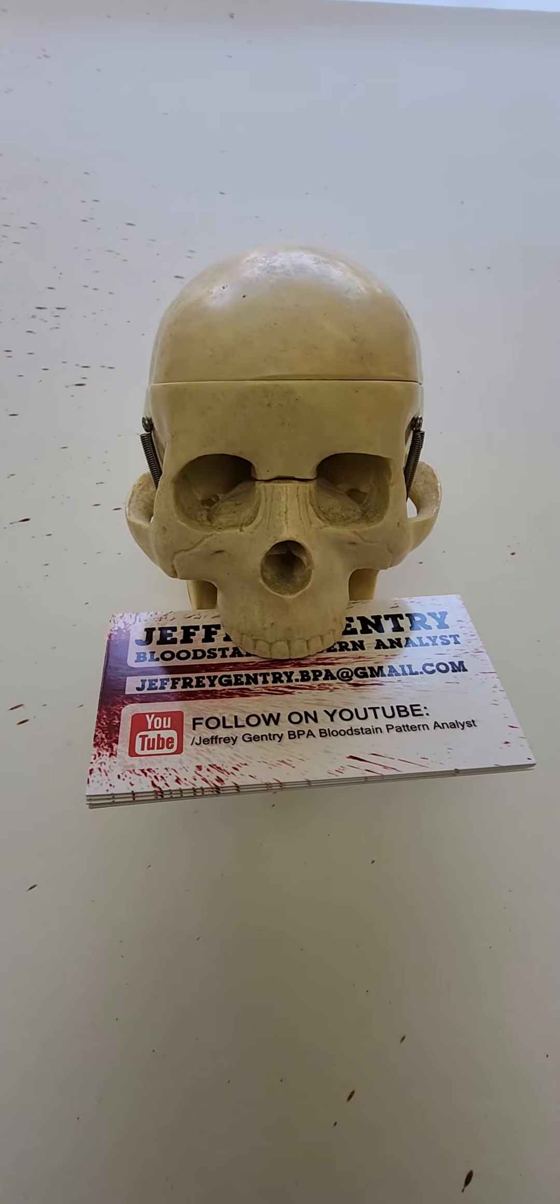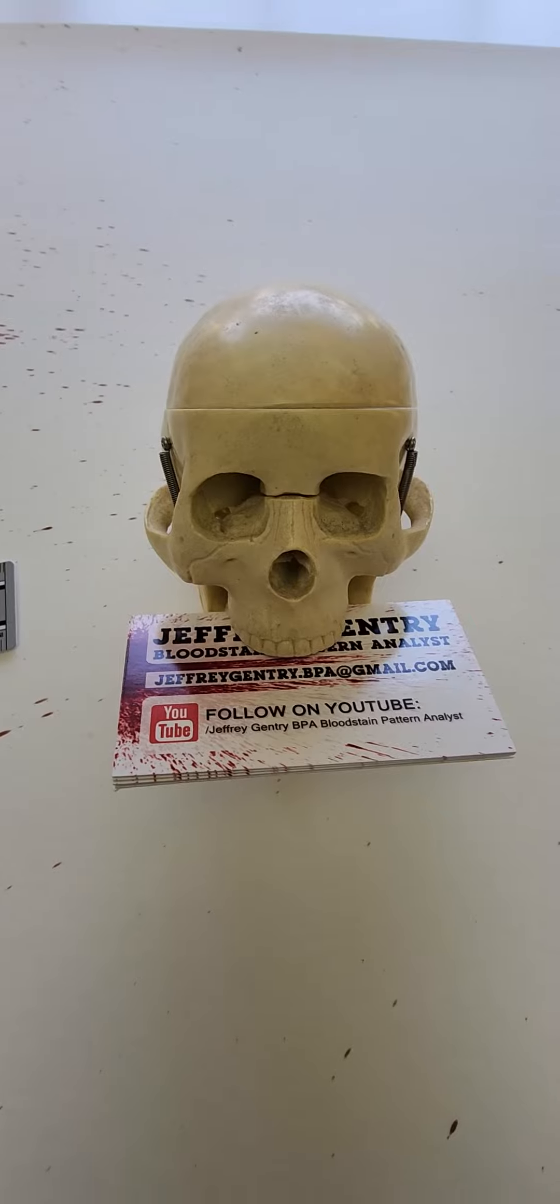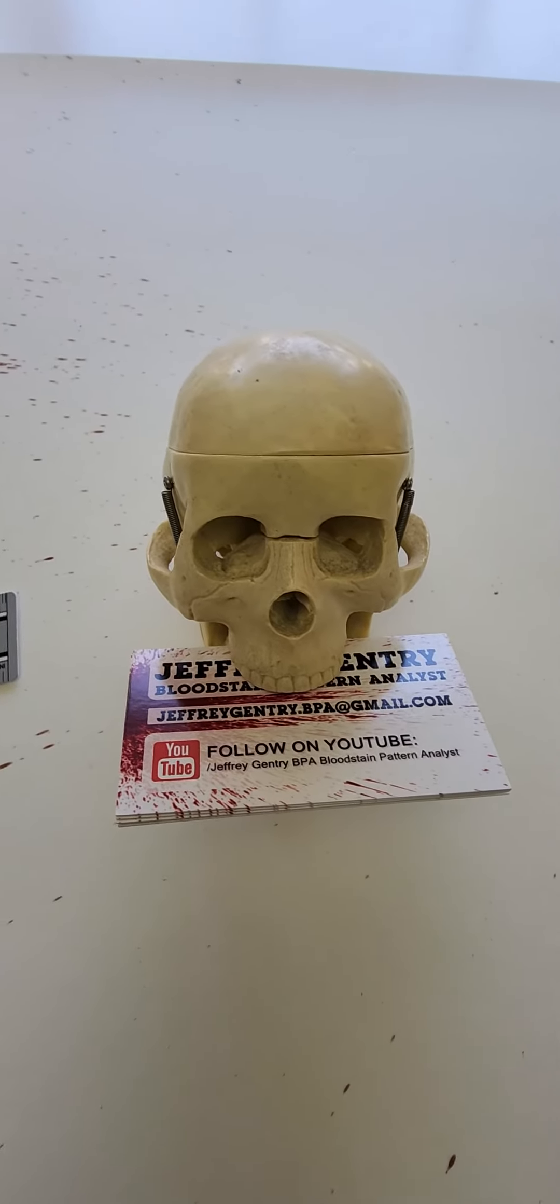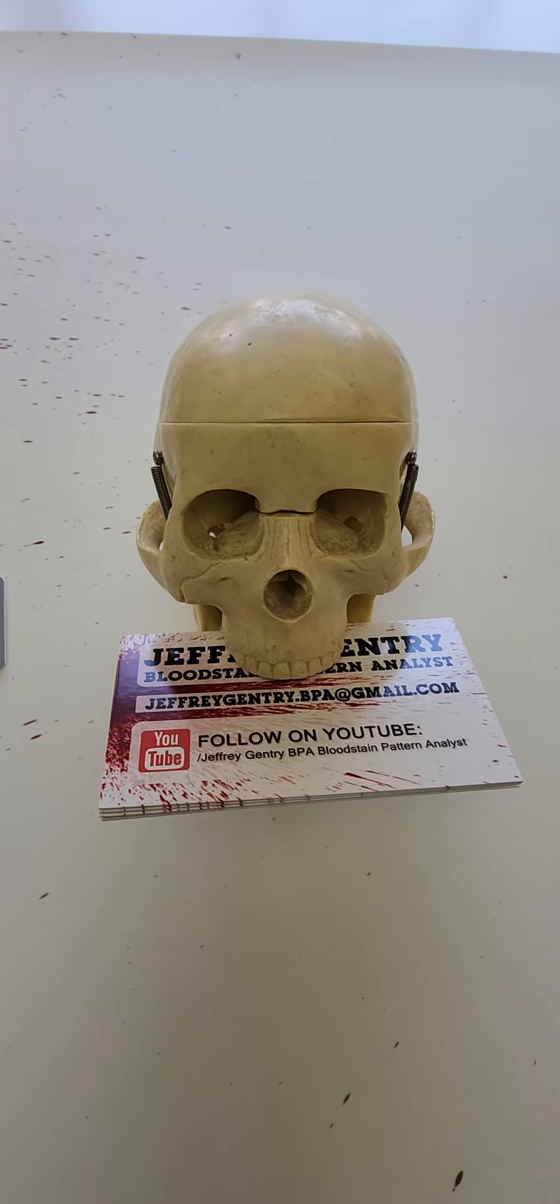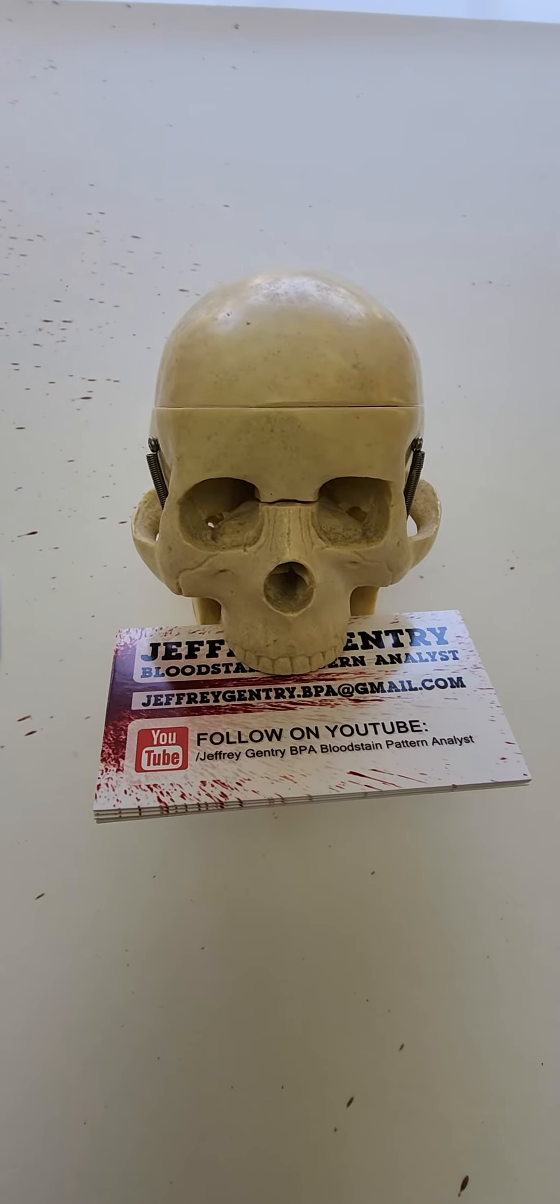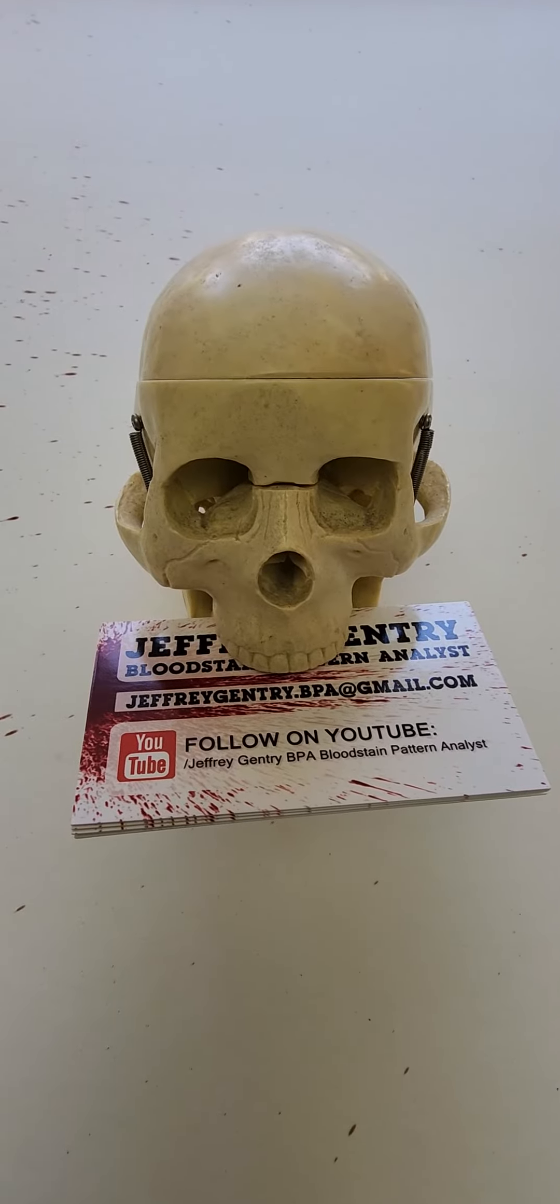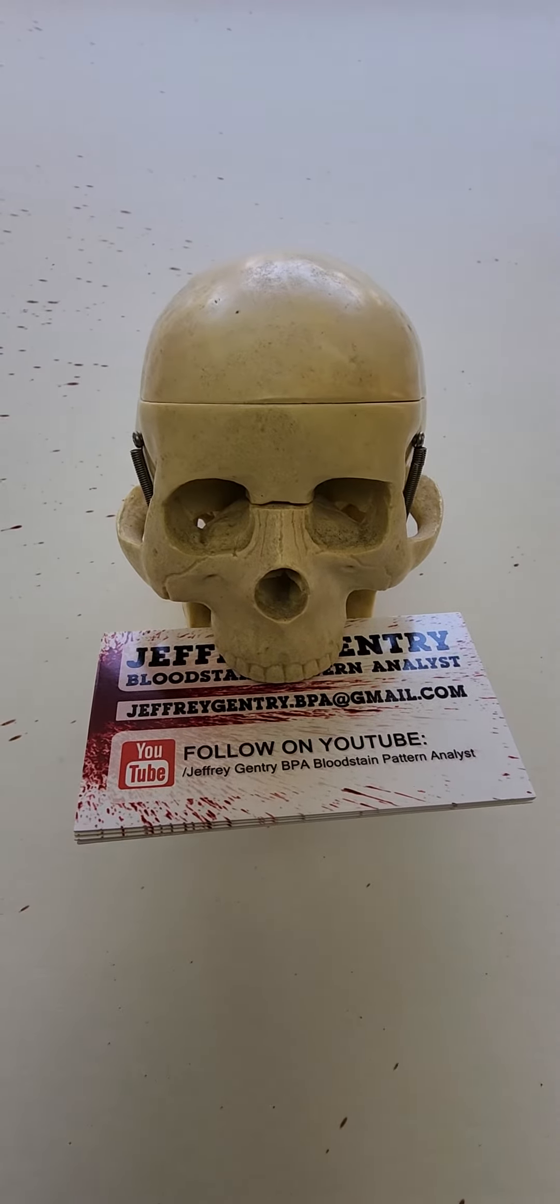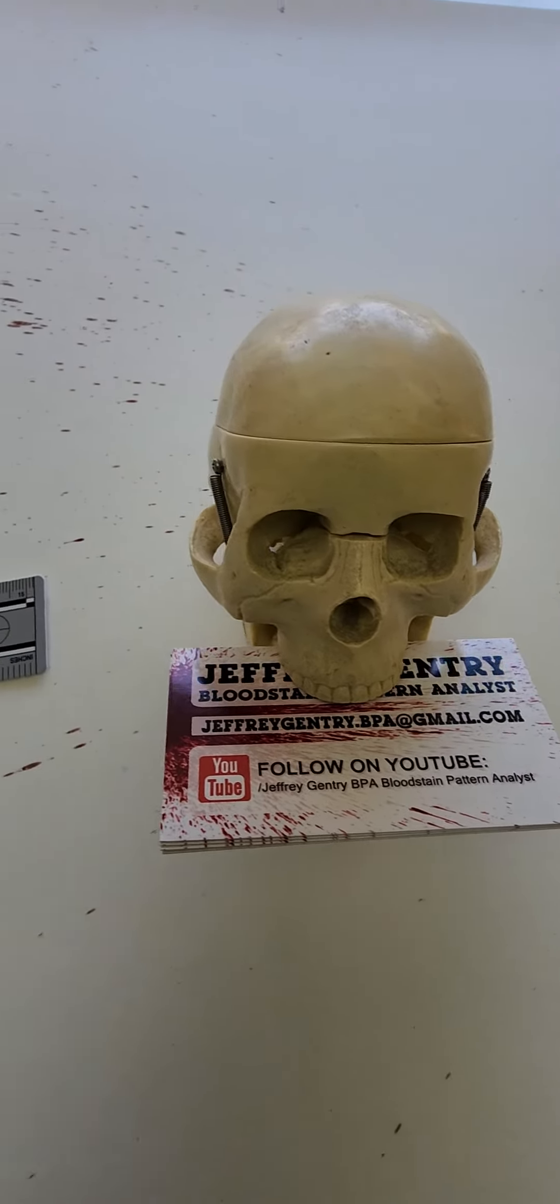This is Jeff Gentry, BPA Bloodstain Pattern Analyst. I have created several impact spatter patterns and today I'm doing some calculations. So I wanted to show something when you're doing your calculations.